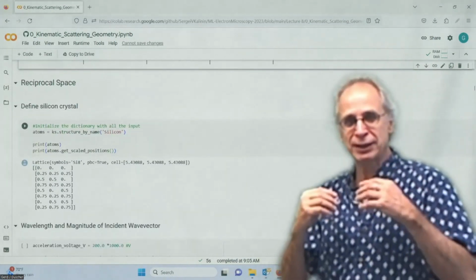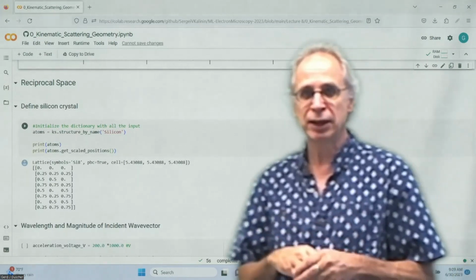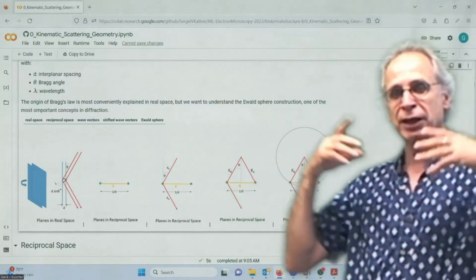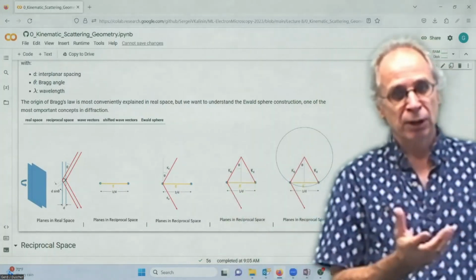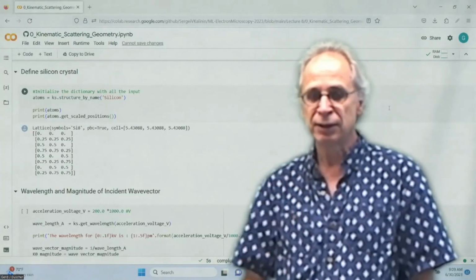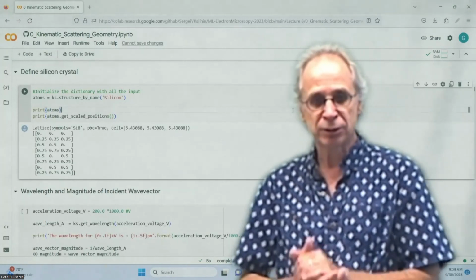How do we use that now to make data and to analyze our data? Actually, this is exactly what we were doing when we were looking at the diffractograms and put our Bragg spots on it. Then we know where the Bragg spots are supposed to be. We were scaling our image accordingly. So this is basic, but we are using it. What we have to do is trigonometry, so it's fast to create these data sets, and that's what I want to show you.